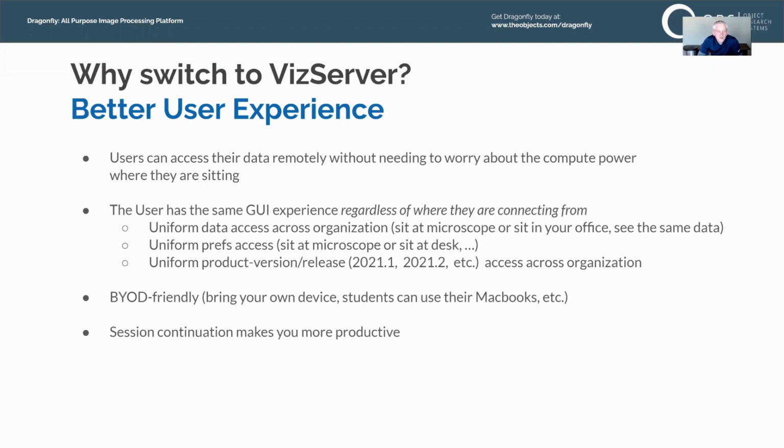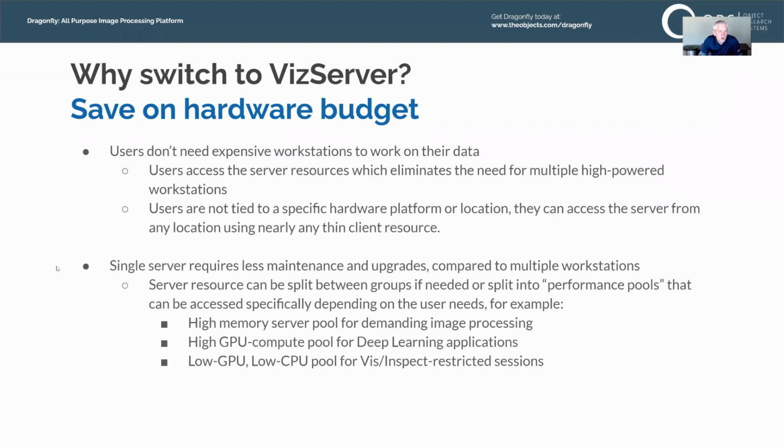This is bring-your-own-device friendly, which means students can take advantage of their own MacBooks or their own Chromebooks. You don't have to rely on having some dedicated workstation or computer to use the software. You're instead using the centralized resources of the VizServer, which is a shared-use facility. And then finally, session continuation is going to make you more productive. You can check in on the work without having to wait till you get back to the office the next day. You can just allow the work to follow you wherever you go. So it creates a better user experience.